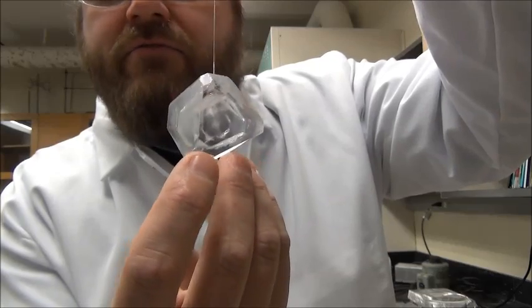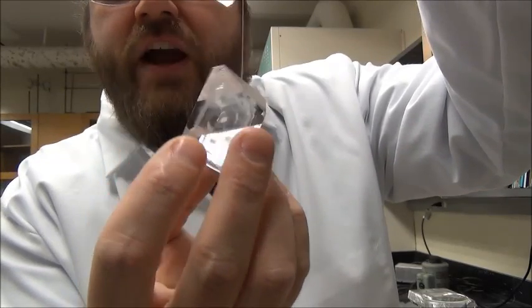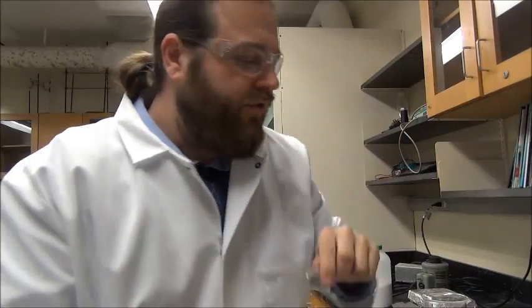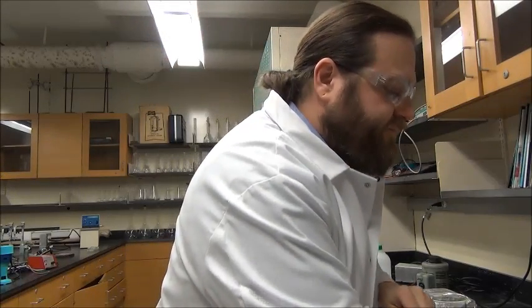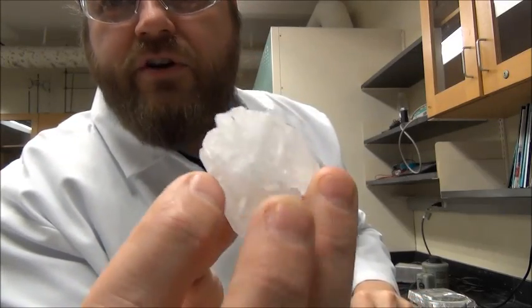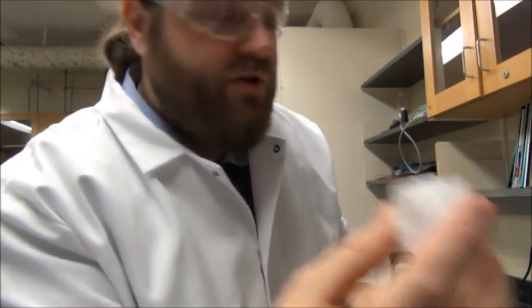So you can see we have very nice, well-defined, reflection — shiny faces, right? I didn't cut this crystal. This is how a crystal grows. What you don't want to get is something like this. You can see this thing is real choppy and it has lots of different crystallites. This is not a single crystal.